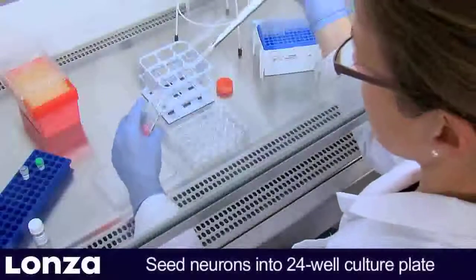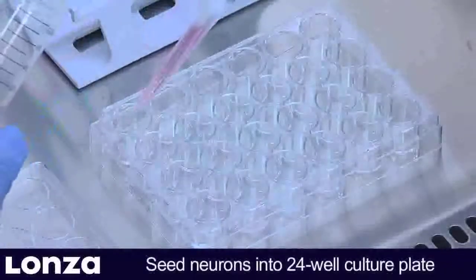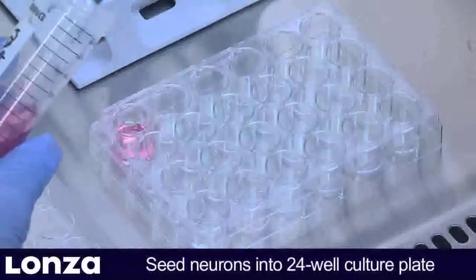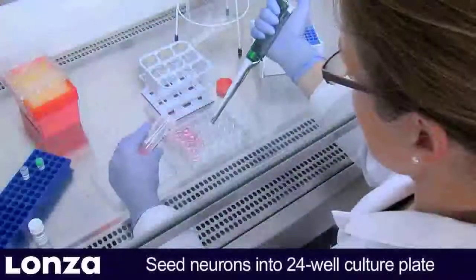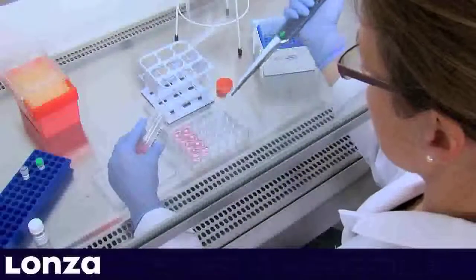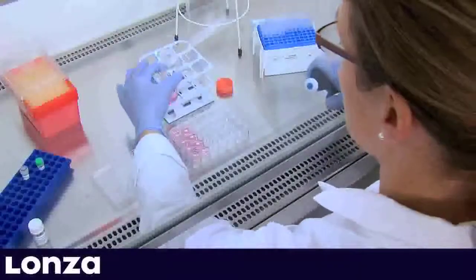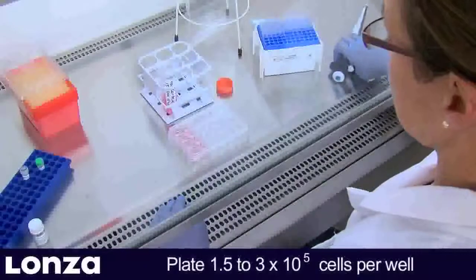The first step is to seed the neurons directly into 24-well plates or onto glass coverslips. Please use plates from Griner or NUNC, or contact our scientific support to check for compatibility of alternative plates. We recommend plating of 1.5 x 10⁵ freshly isolated or 3 x 10⁵ cryopreserved neurons.